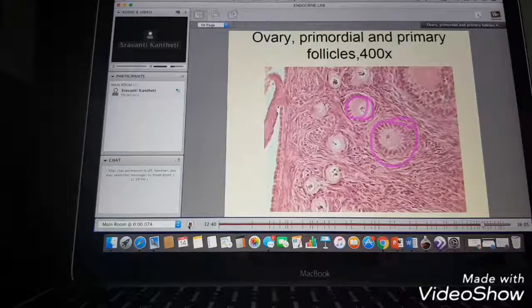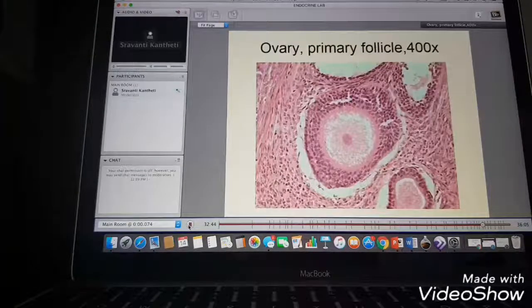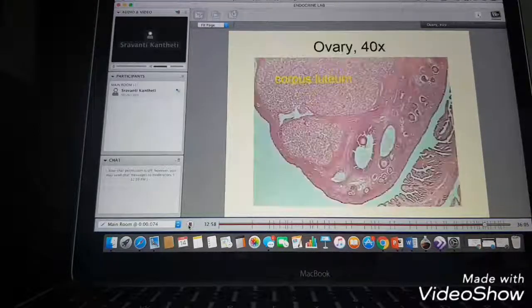So these are all the follicles that you will see in an ovary. Do not get this confused with the thyroid gland. Okay, I see that mishap a lot. How do you know that it's not a thyroid? Because in here it actually has stuff in it. If it was colloid, this would be clear. Okay, so tons of tissue there that you can see.